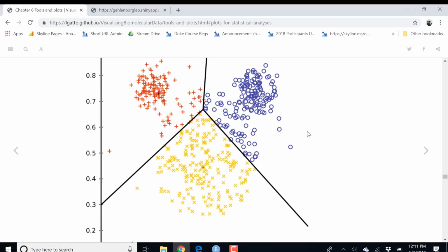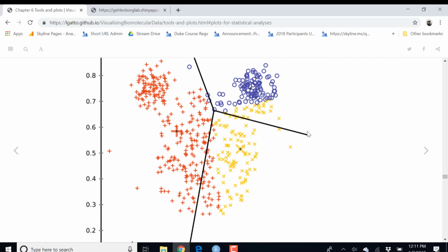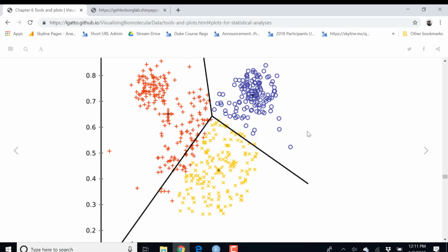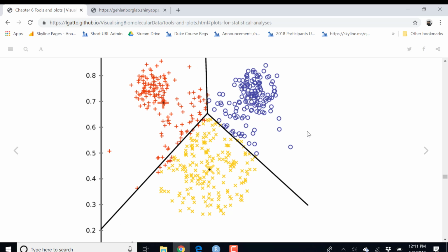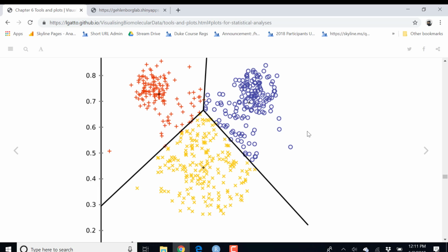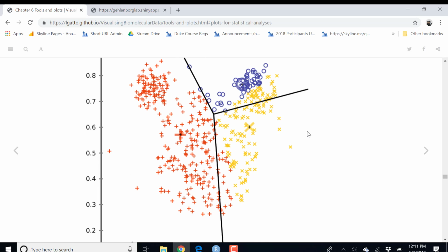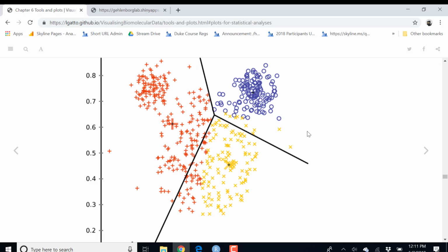It's a kind of mathematical operation that clever people came up with because they want to put some order in the data. But there is no reason why the proteins should cluster perfectly. Roughly, we will see some patterns, but for some proteins that are between or uncertain, it's maybe a bit futile to want to assign them exactly to a cluster.